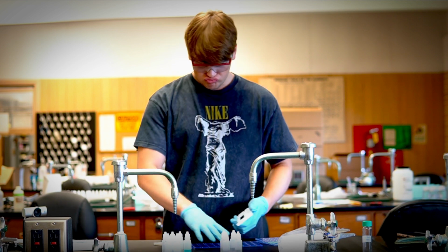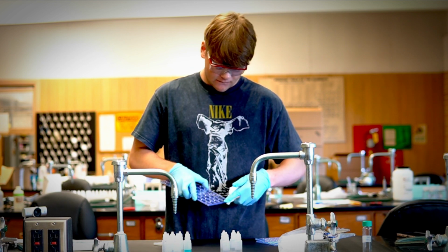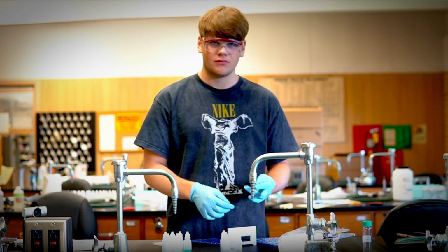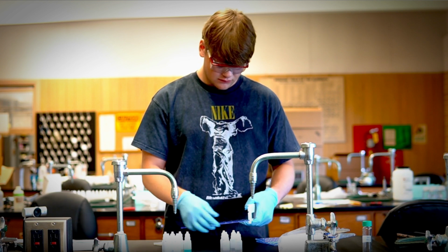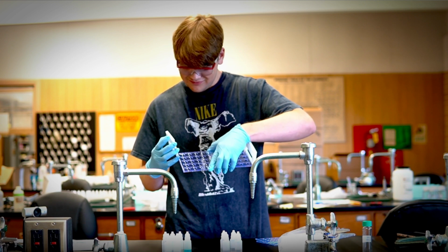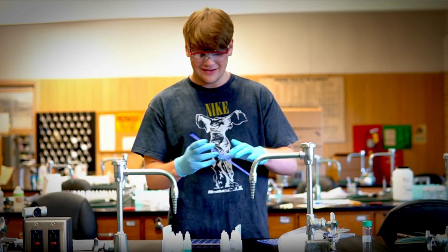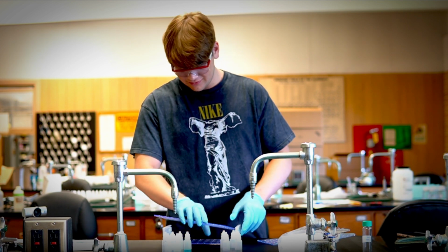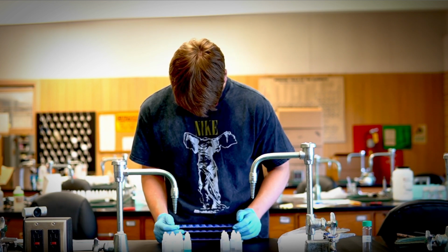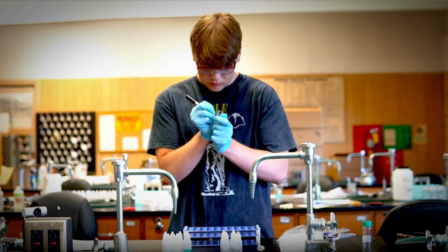You will start by assembling the test tube rack as shown in the video. As you can see, it should be easy to assemble and put together, and after assembling it, you can use it for the remainder of the lab. So make sure that they snap together and all go together the way they're supposed to go. It might take a little bit of moving around, but after a while you should be able to put it all together. Now you are ready to label your tubes.